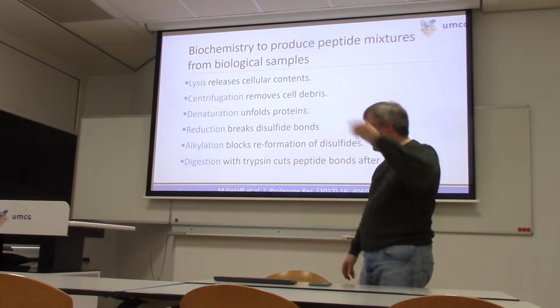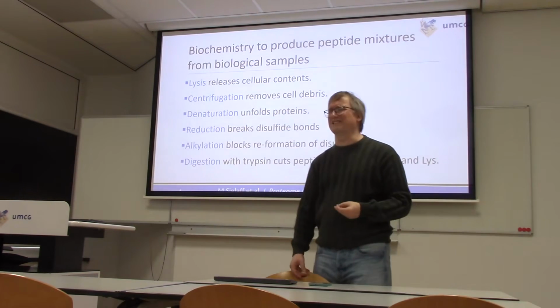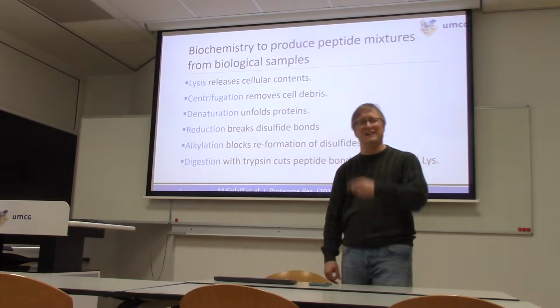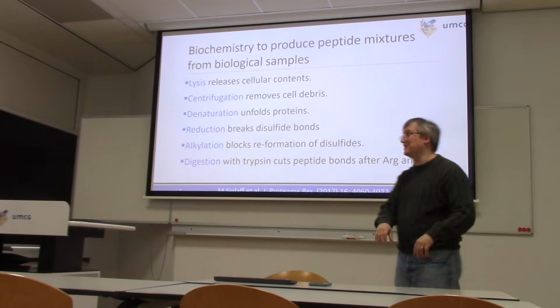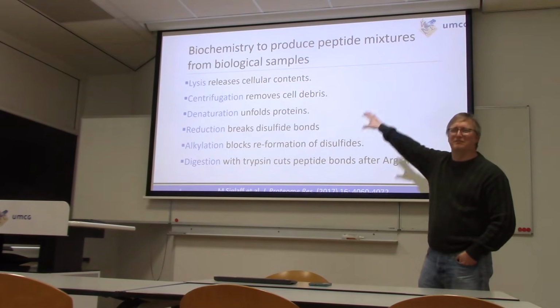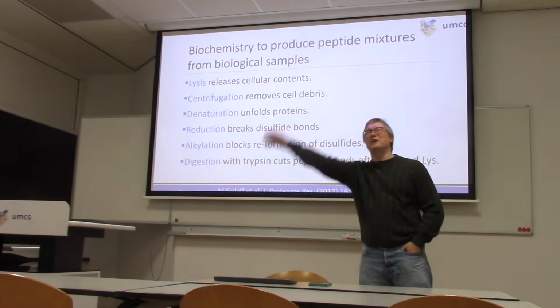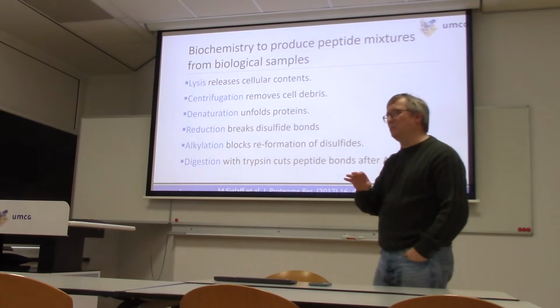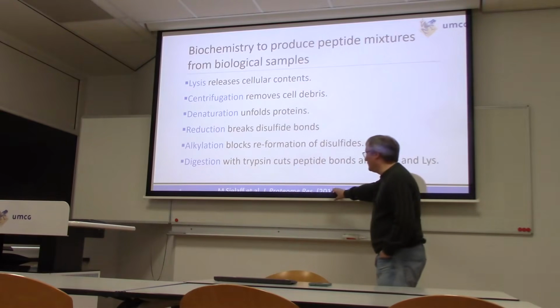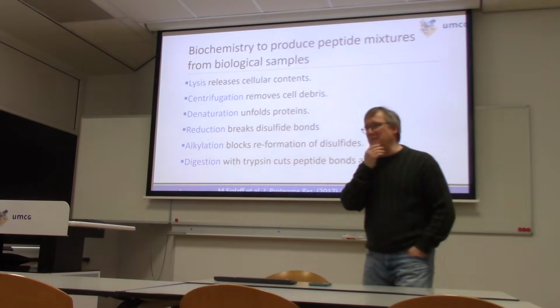DNA and RNA? Bingo, yes. That sticky mess that looks like snot, you do not want to shoot that into your mass spec alongside the proteins. So we have some work to do to get the proteins by themselves. So I'm kind of arcing over a huge body of work here that I hope will be something that, if you really care about, you can read about further in this paper down at the bottom.